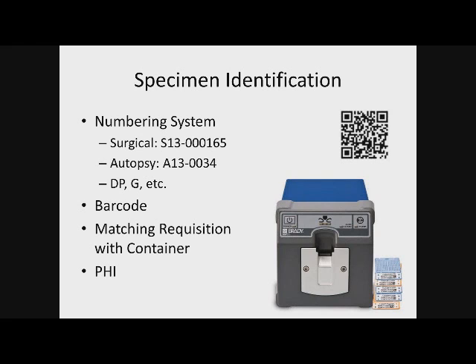And it also helps with protected health information, the HIPAA laws. We don't have as much information on the cassette itself. The barcode can relate directly back to the laboratory information system, which contains all the patient information.